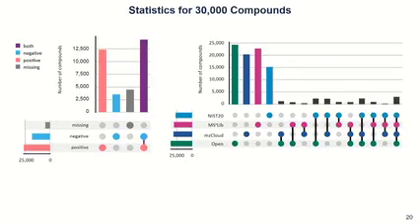And this is just, again, some statistics. So I want to highlight why positive and negative mode might be interesting for you. It's good to see that a lot of compounds were detected in both ion modes, but still we had more than 2,500 compounds that we could only detect in negative polarity. So it really depends what your compound of interest is. We need to be aware of what we can miss if we only acquire in one polarity.